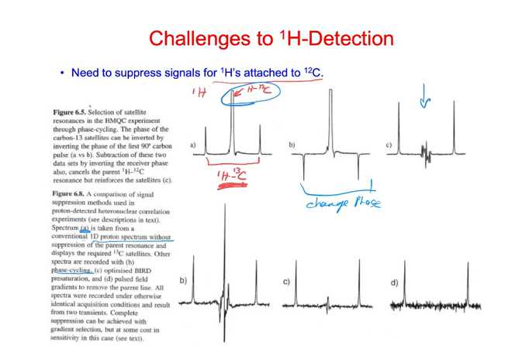And so the next one, C, was with some type of phase cycling, and you can notice that it's suppressing this quite a bit, but it's still kind of noisy in the middle. Oh, that's C. No, what is this? A, B. I'm doing this wrong. Okay. B, C. Here we are.